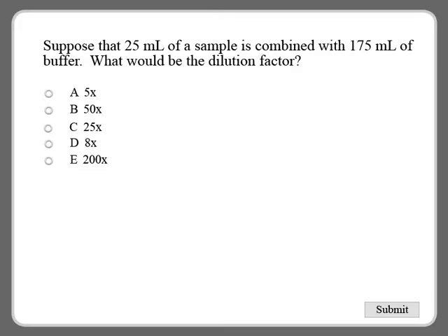Now let's put it all together in an example that includes the Bradford assay and the dilution factors.